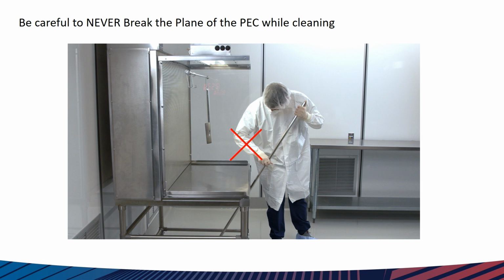Special considerations. Never break the plane of the PEC while cleaning. Patty yesterday told a great story about someone had rolled up an anti-fatigue mat in front of a PEC and actually placed it inside the PEC so that they can mop underneath it. You're always looking for somewhere to lean a mop handle so it doesn't fall over on the ground. I've seen people just lean their mop, and the end of the handle where their hand has been touching is stuck right into the center of the PEC.